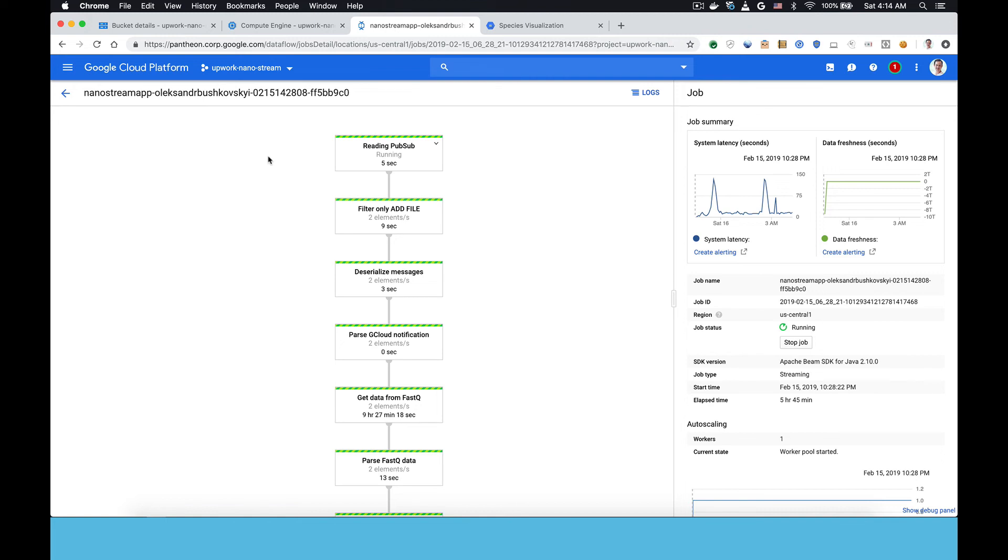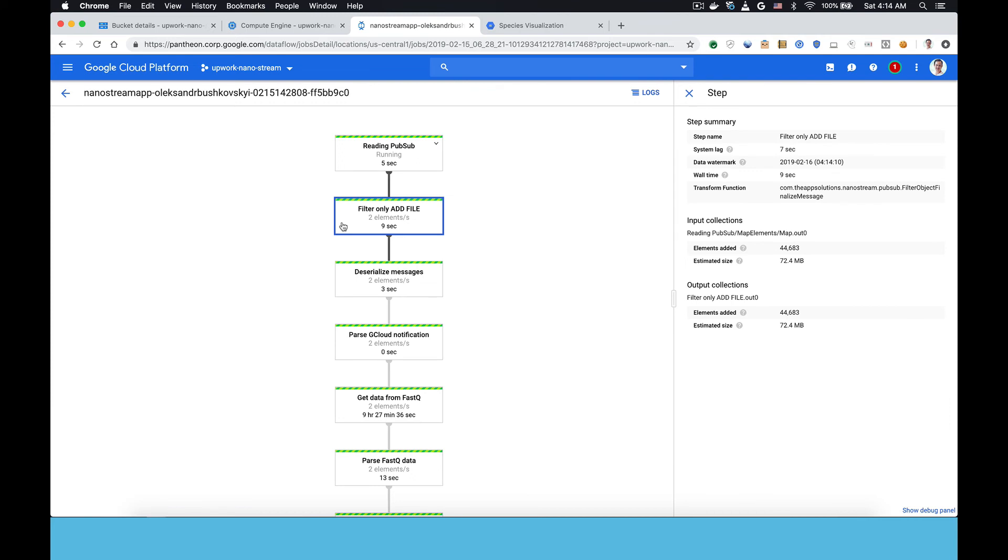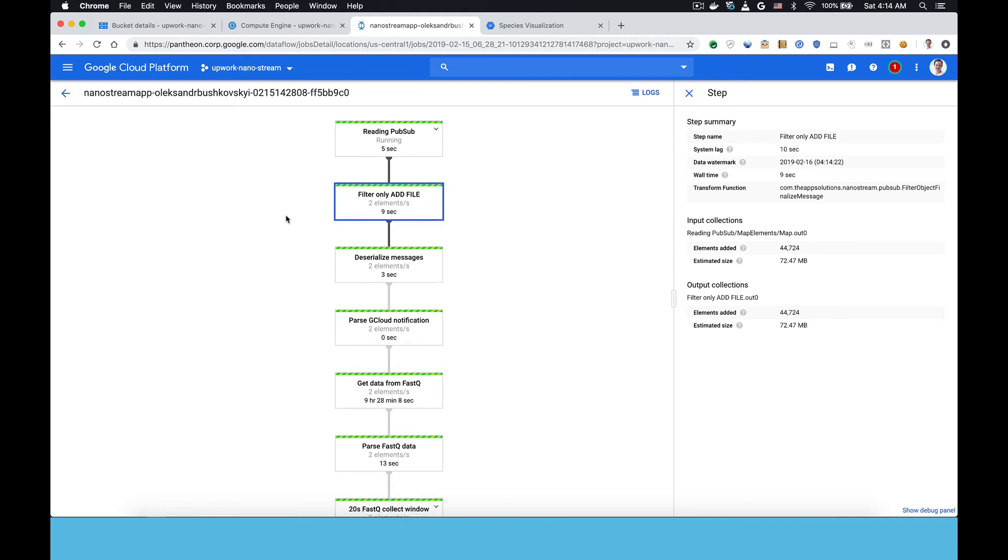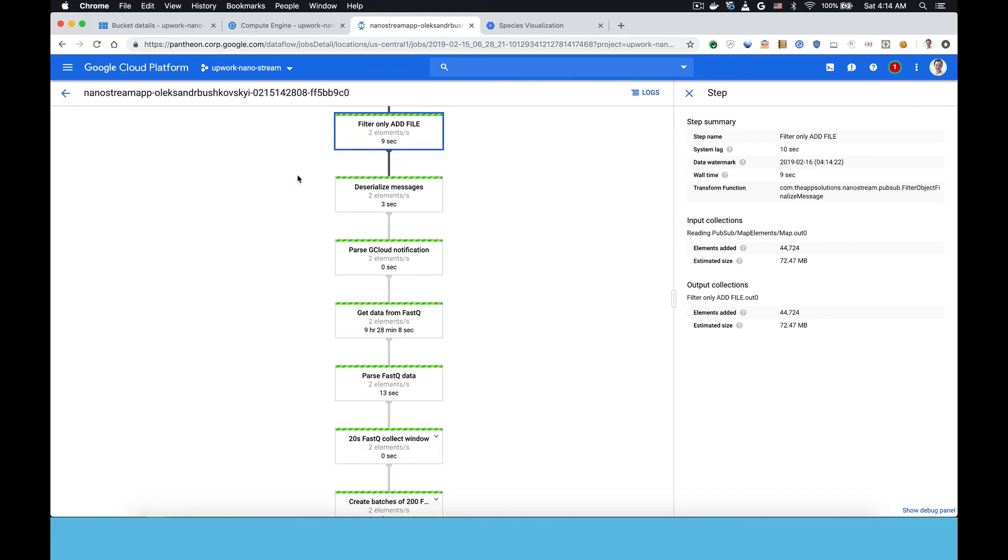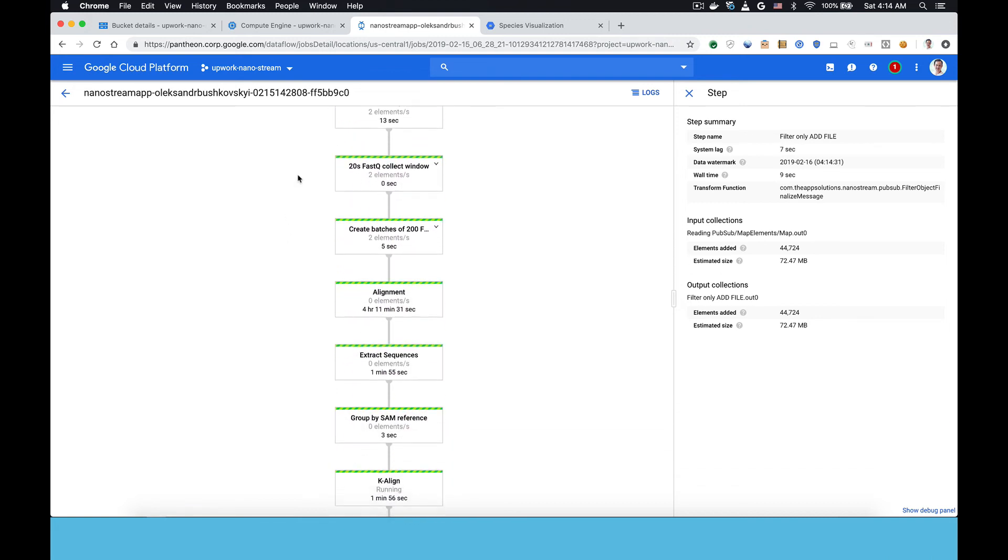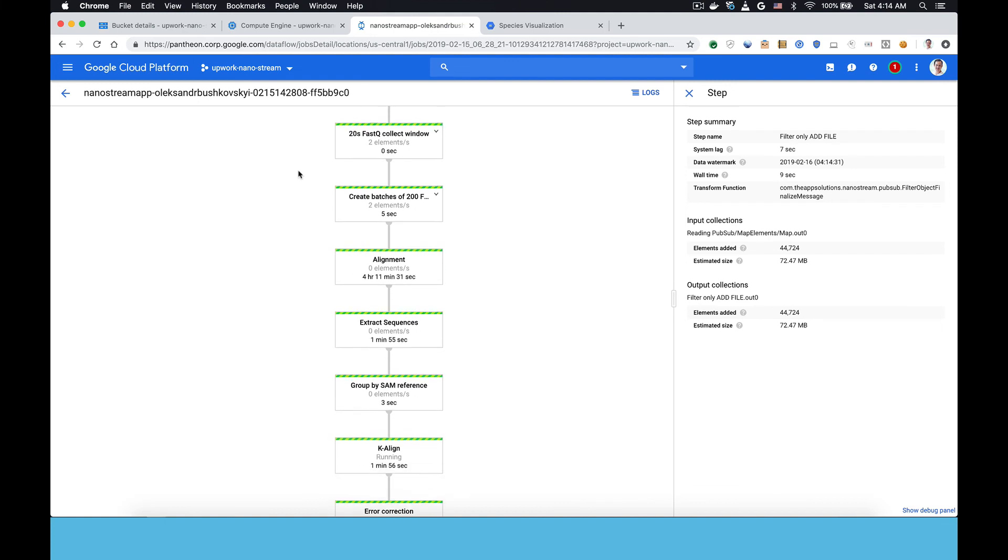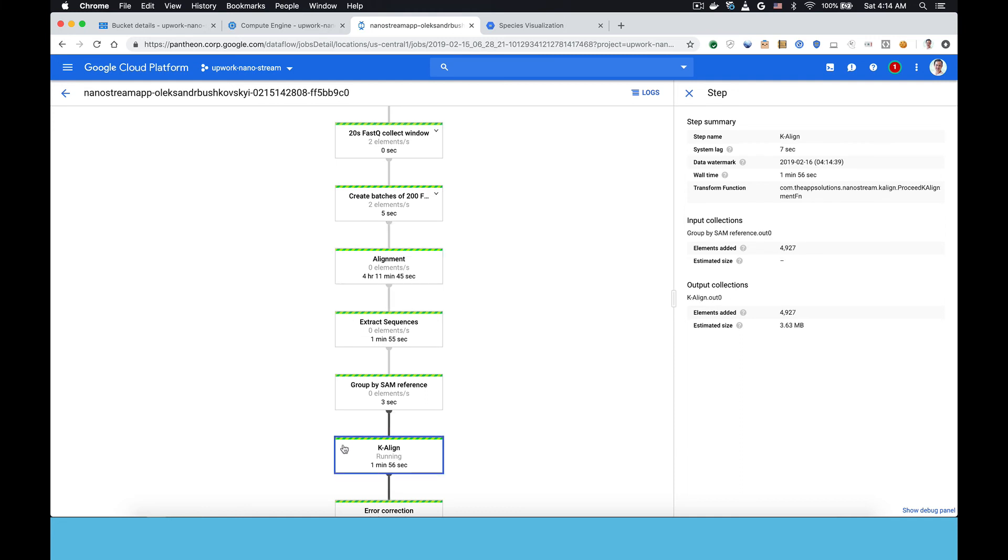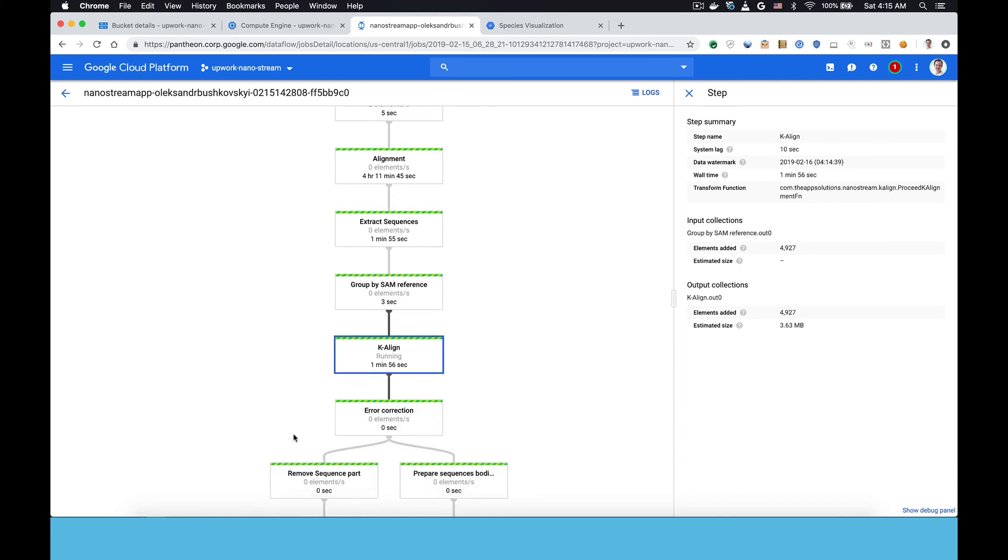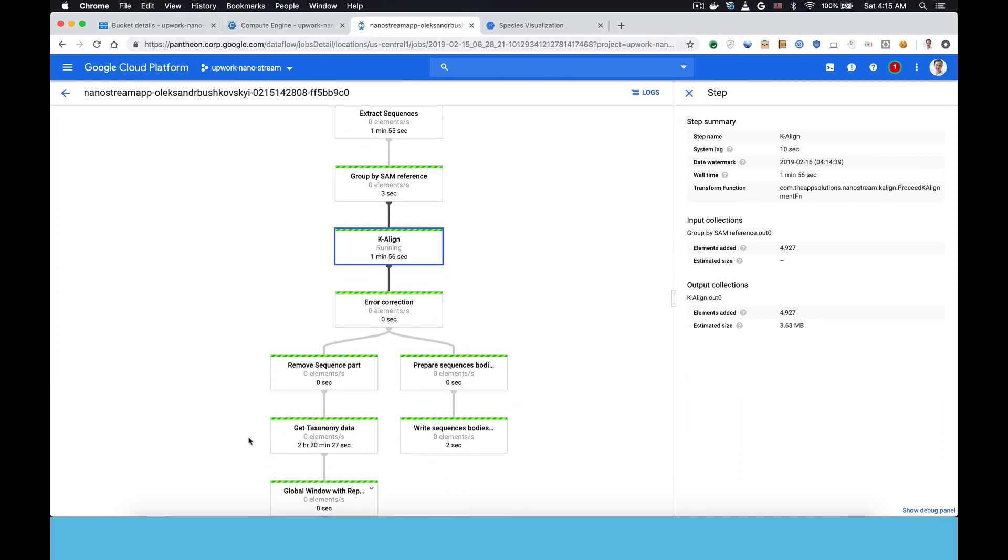This is the data flow that was visualized in the diagram I was showing you earlier, but this is actually coming from the source code. So you can see here is where files are being added. Then they go in batches of 200 sequences to an aligner. This is calling out to the alignment cluster.